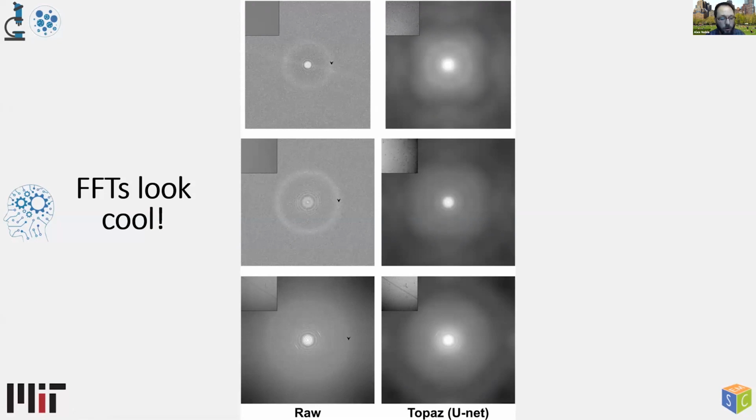You don't want to feed any denoised micrographs, or in the future tomograms, into alignment and reconstruction, because there's a general problem in neural networks called the hallucination problem, where you might be introducing false information into your post-processed data because of it being in the training data effectively. And that could be out in these high frequencies. So I would suggest not using those high frequencies, really.